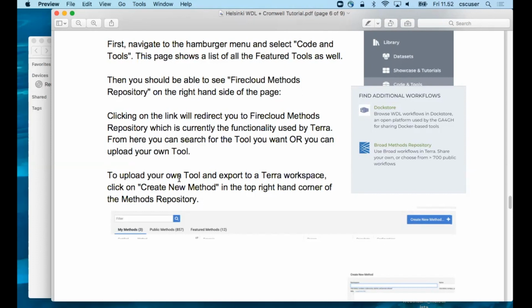Are we good? So how you did that is basically load from file and then find that file in your directory, which is in your GATK bundle that you're using until now to run your WDL files.